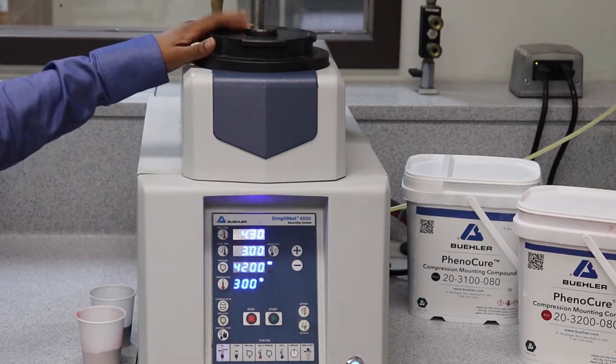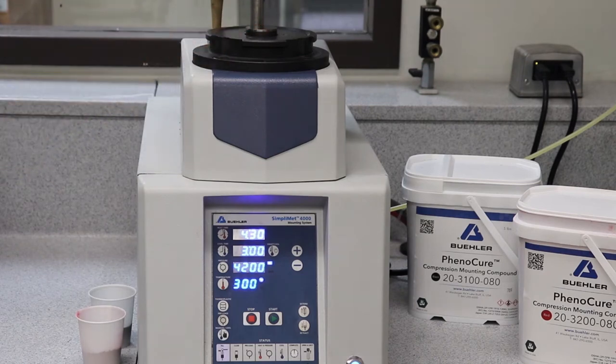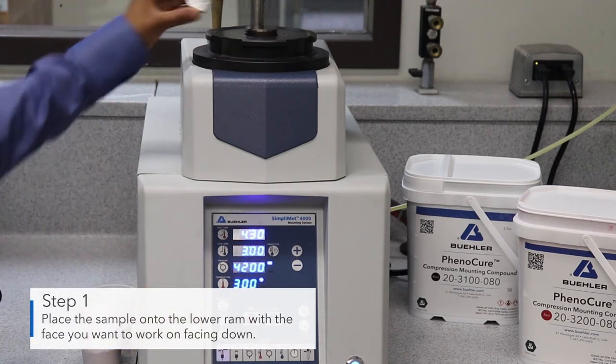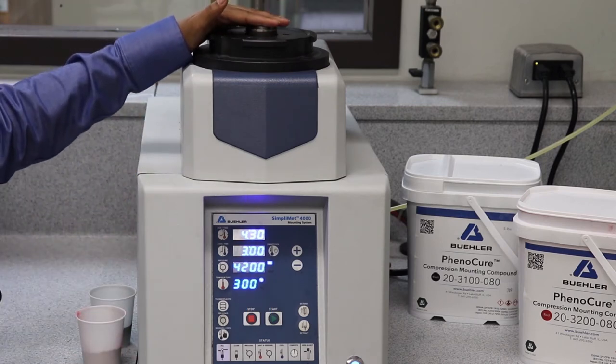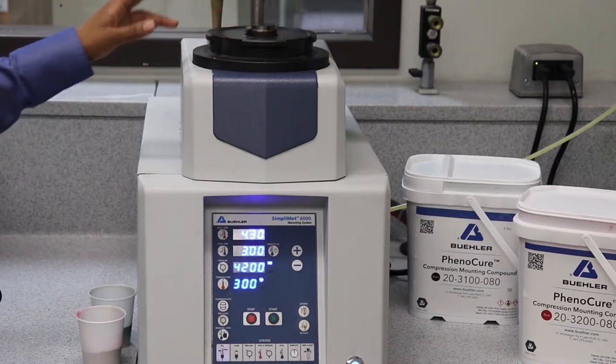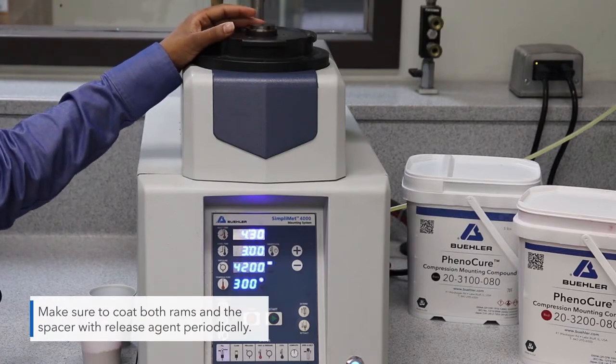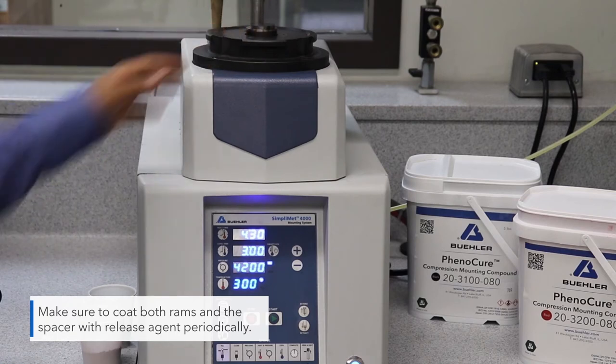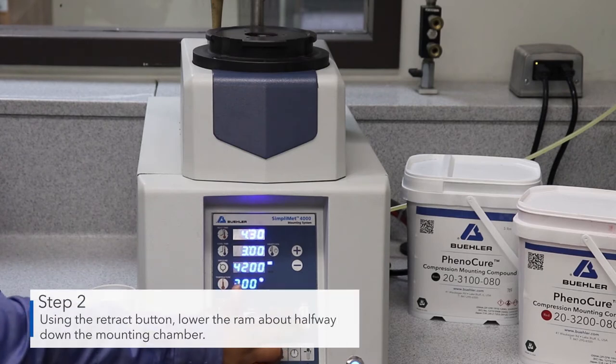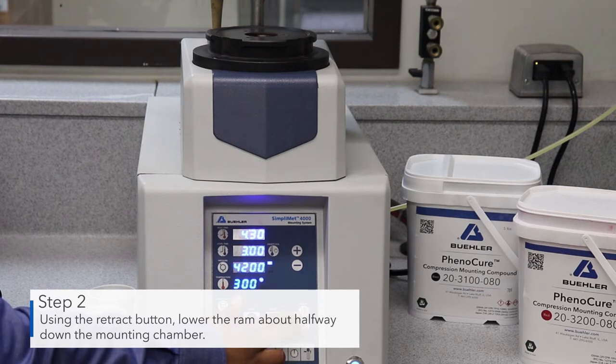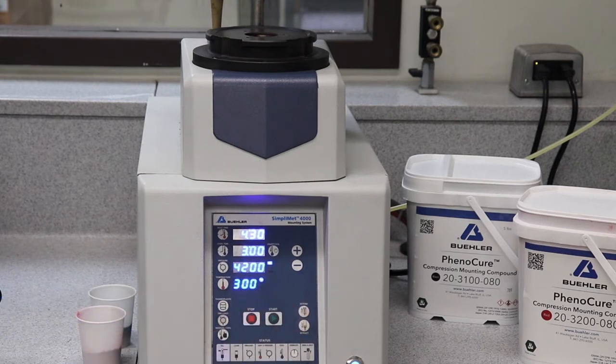Now we have the lower ram already up. All you have to do is place your sample. The lower ram has already been coated in release agent so that the samples don't stick. Then you lower the ram about halfway into the chamber so that you can pour your mounting media on top of it.